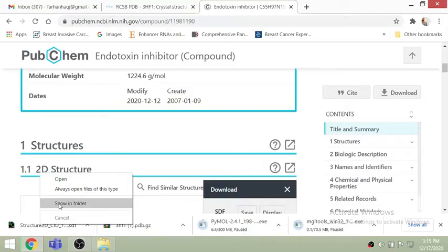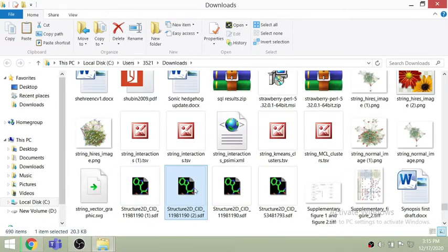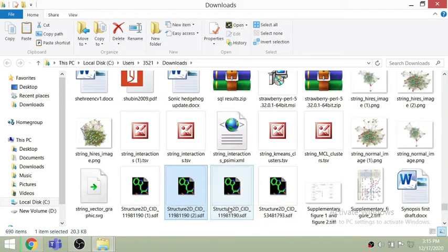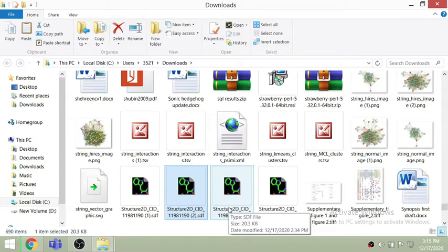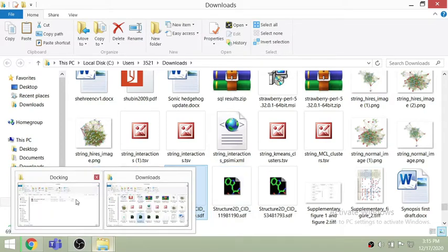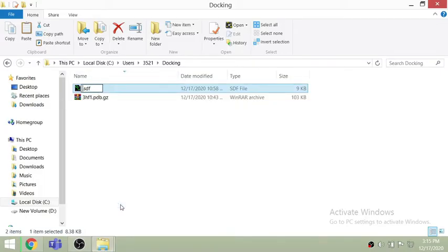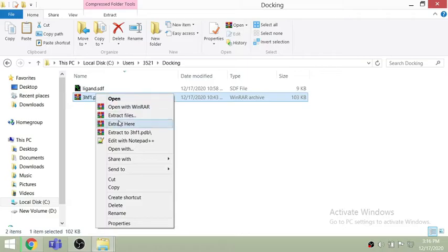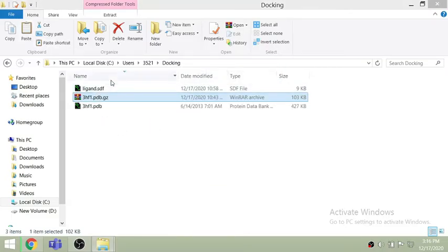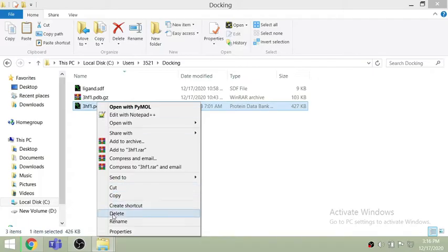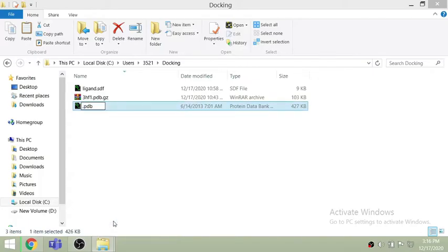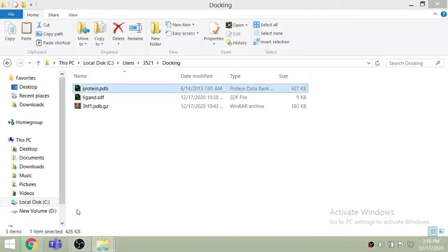First, go to the folder. You can see I have downloaded the SDF extension file — that is the ligand — and I am renaming it as 'ligand'. Then I am extracting the PDB file of the protein I downloaded from RCSB. I am renaming them as 'ligand' and 'protein' respectively.